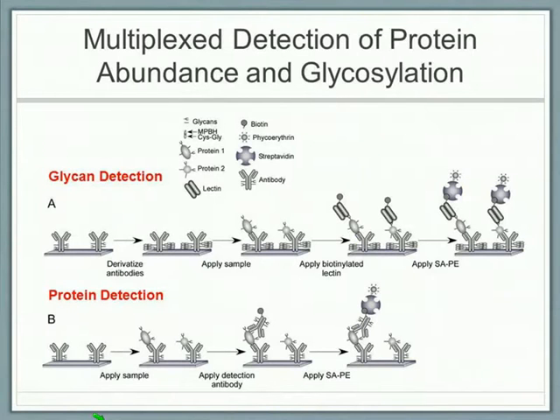I wanted to also show you that the multiplex detection can be used for not only protein detection but glycan detection. That's a format we've really worked hard at, and we found a lot of value in biomarker studies because in many cases in disease situations, not only the protein abundance can change, but also the glycosylation on the protein can change. So we found that if we detect both the protein abundance and the glycosylation, or specific glycoforms of a protein, we can get more information about a disease state.